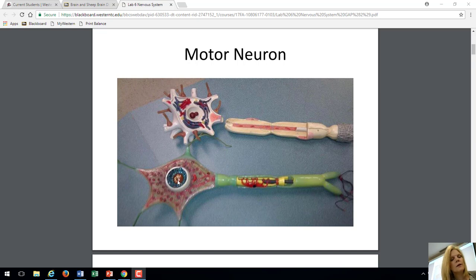And then inside the nucleus are these smaller organelles. There might be one or two, and that's a nucleolus. More than one, we call nucleoli. So nucleolus or nucleoli. So just be sure you don't think of that as the nucleus. The larger rounded space outside of that is the nucleus, and this is the nucleoli.